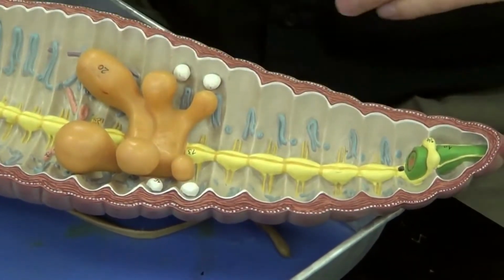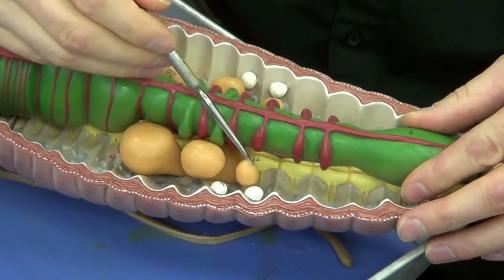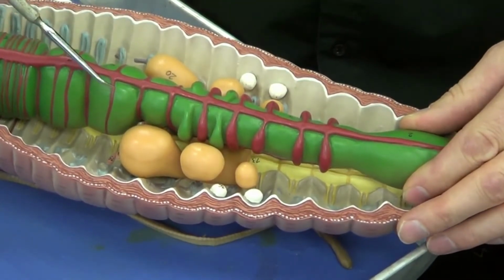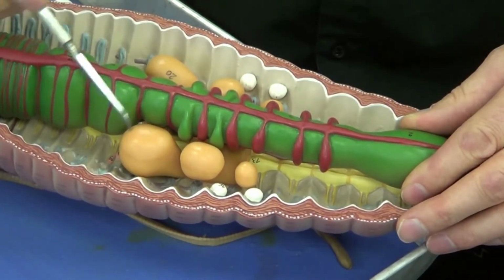Now let me go ahead and put this back together again. And you can see 2 cream-colored organs on either side. These cream-colored organs are going to be called the seminal vesicles. And their job is to produce sperm that will be used to fertilize the eggs of another earthworm.